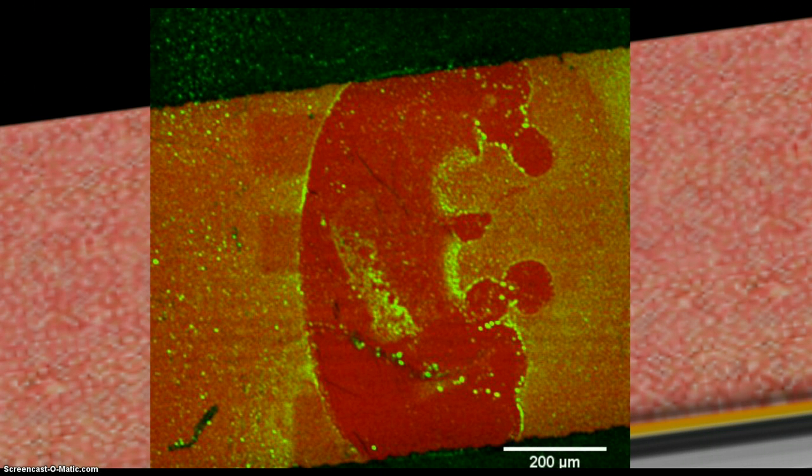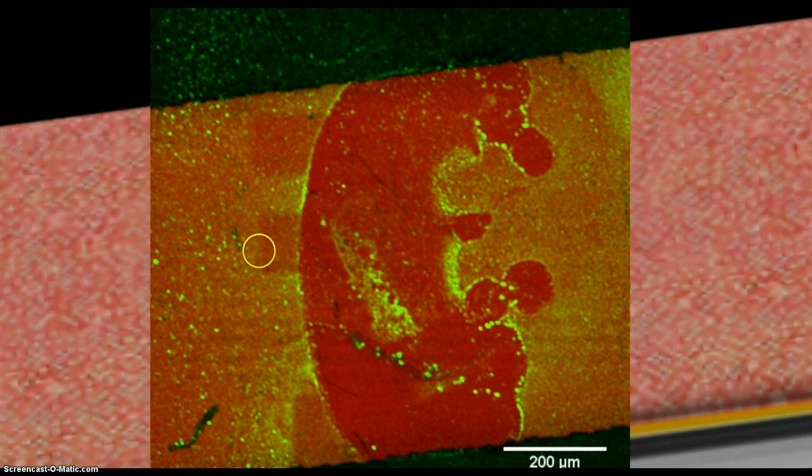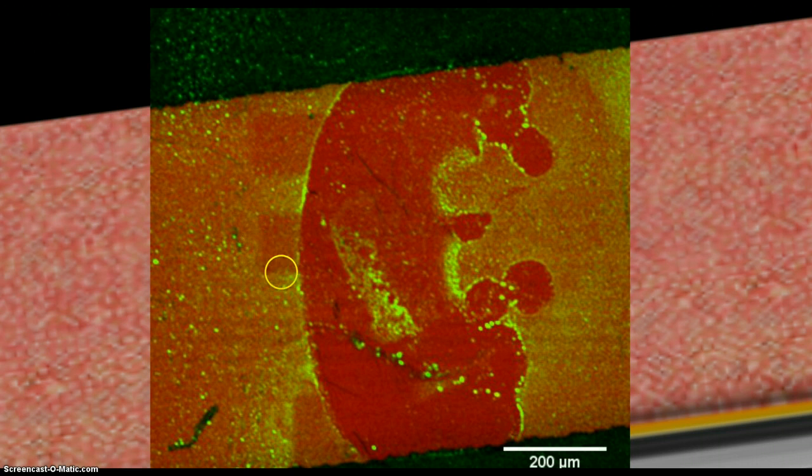To demonstrate that the membrane is actually there, and that we are not simply viewing reflection off the gold, we have photobleached some of the membrane, which is these square regions here, and here.